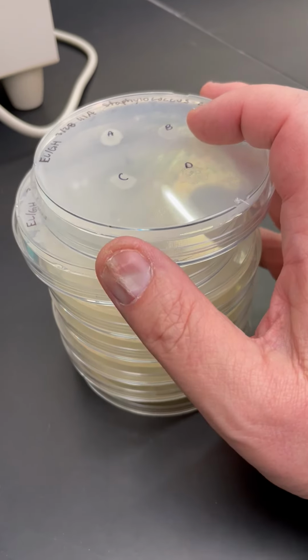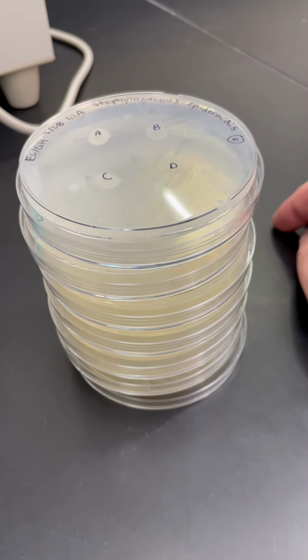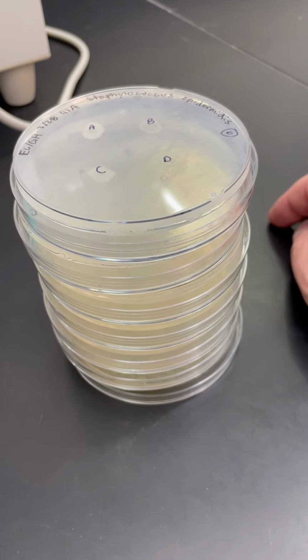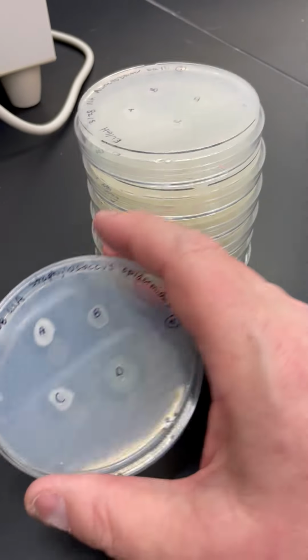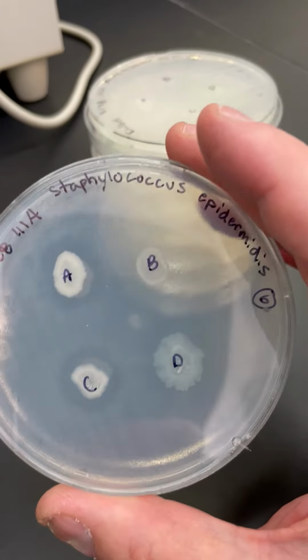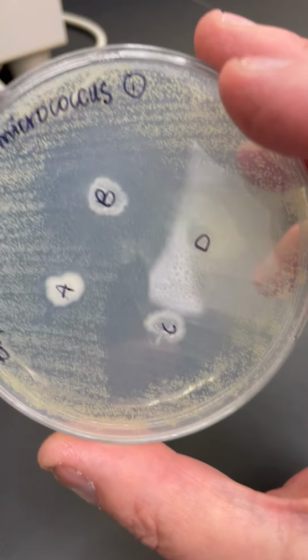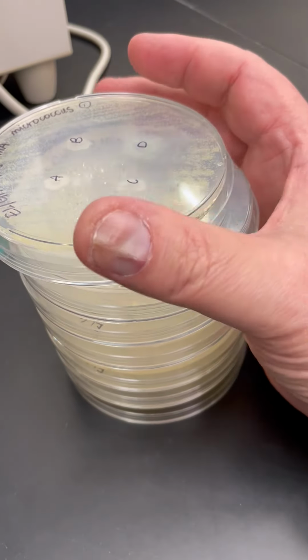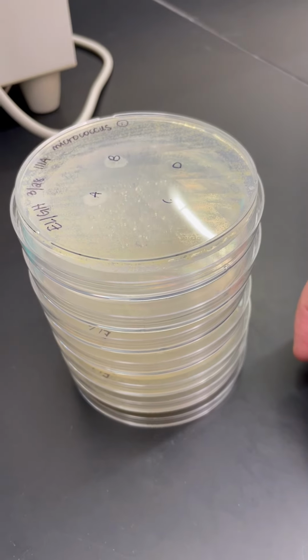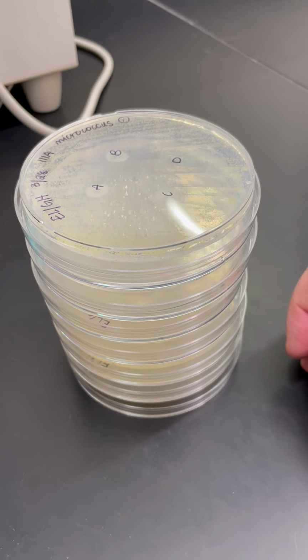Now I want to say a little bit, I noticed this with a couple of people in the Tuesday labs. I think some contamination worked its way in. So you notice how you have the background that's nice and light? Do you see that? But if you had lots of little colonies, and when I say that, I don't mean it this way, because that's all Micrococcus. But if you had a bunch of larger colonies, those are probably contaminants. And if that happens with Staphylococcus, and it might have, I hate to tell you to ignore it, but look at it in a very critical way.